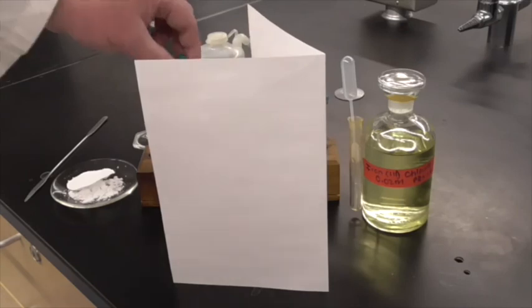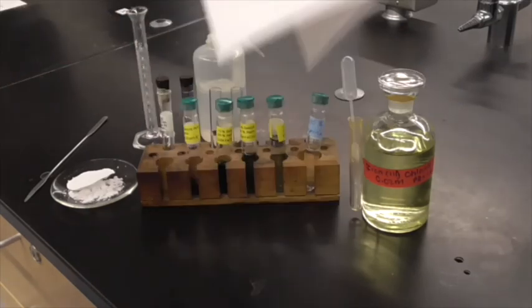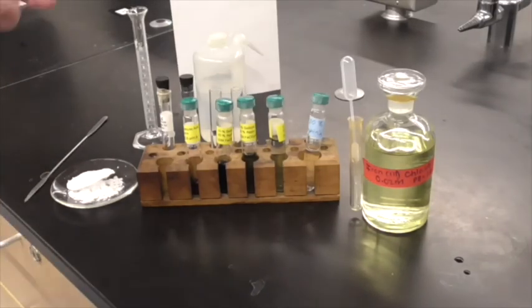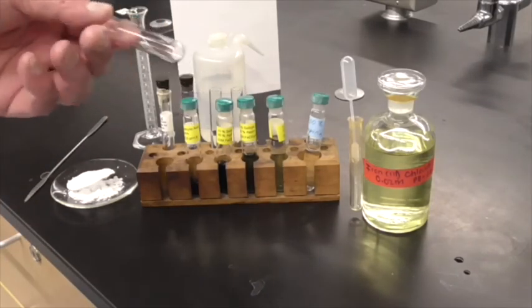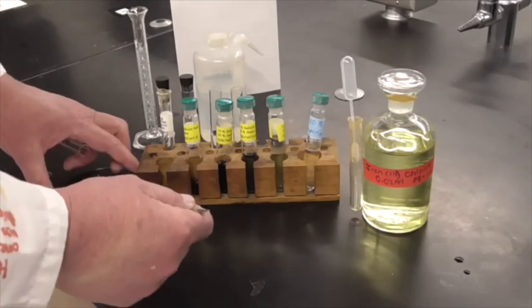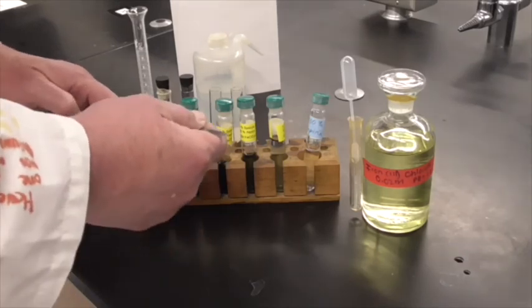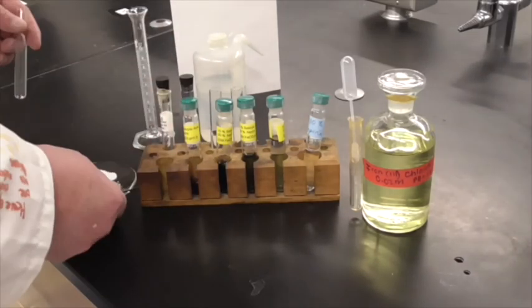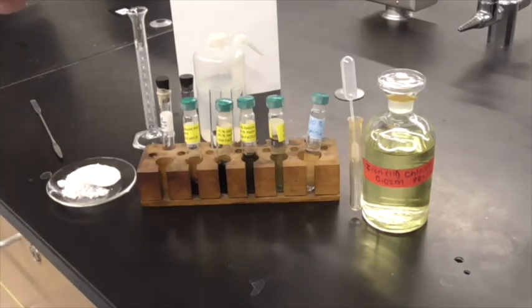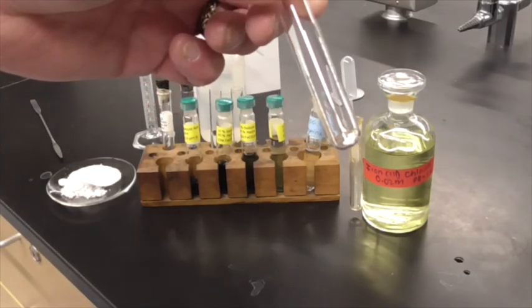Right? So what I want to do is take some of our product, and I'm going to add some water. It's not going to dissolve all that well. Aspirin doesn't dissolve in water all that well. I'm going to take a little bit of our product here and put it up here so you can see there's just a little bit of crystals in the bottom.